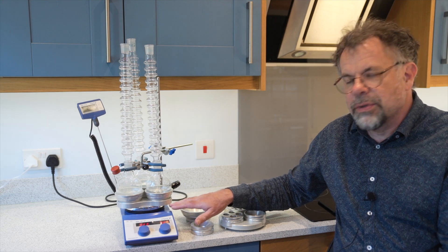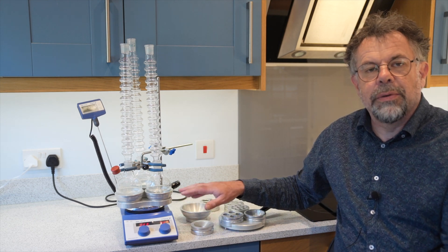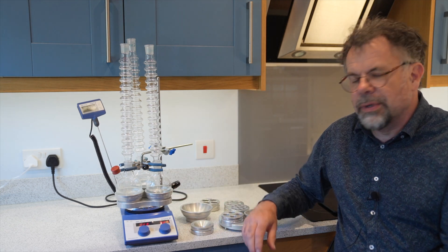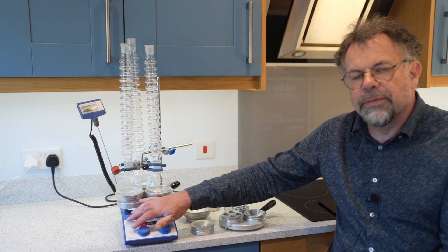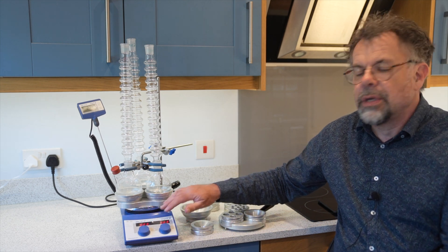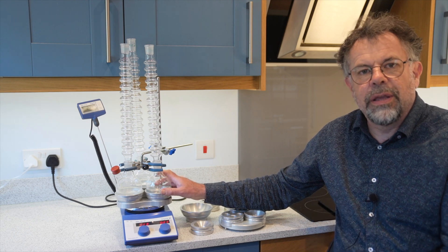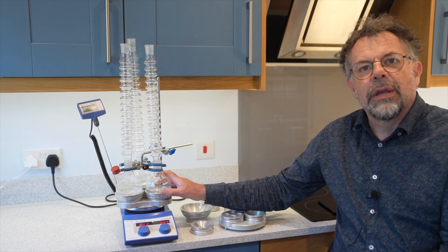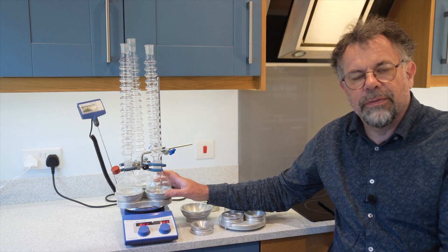Many of our customers fit the hot plate stirrer onto a lab jack, so after synthesis they lower the lab jack just a small amount to allow the flask to cool more quickly. The Driesing block is made of solid aluminium that's anodized, and it performs much more effectively in terms of heating rates and energy efficiency when compared to an oil bath — and of course much safer as well.